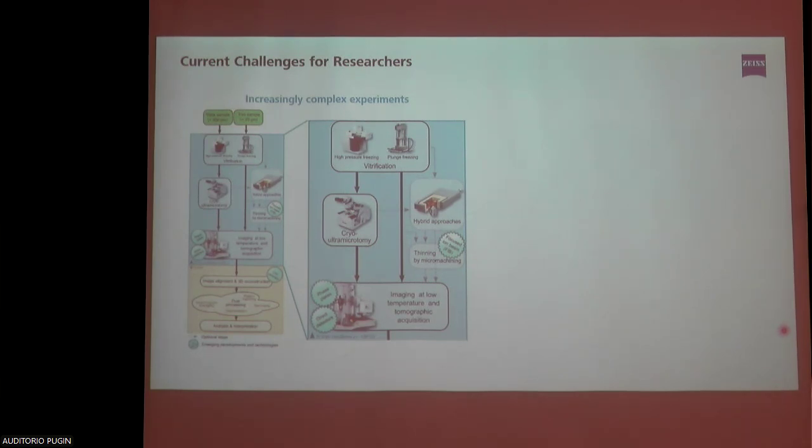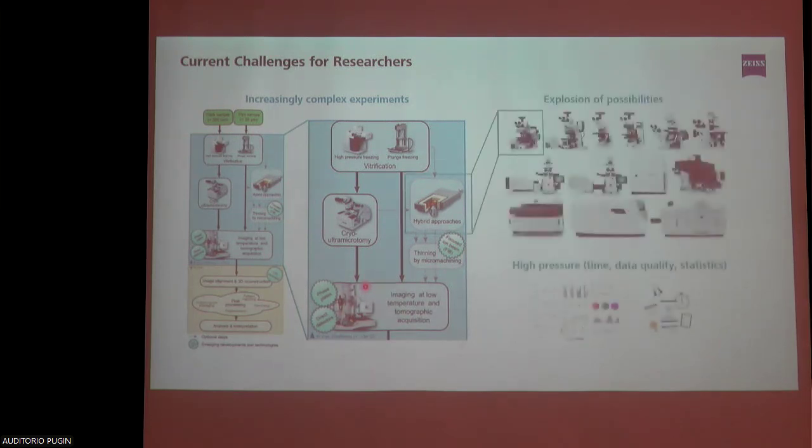So you have to be a little expert in all the different technologies that are available to actually prove maybe pictures that come from a microscope and that are validated, for instance, with a biochemist approach. And also where we take a look at the single technologies within that complex multi-methodological environment, we also have an explosion of possibilities. 30 years ago, we maybe had just 5 or 10 different general types of microscopes from which you could choose.